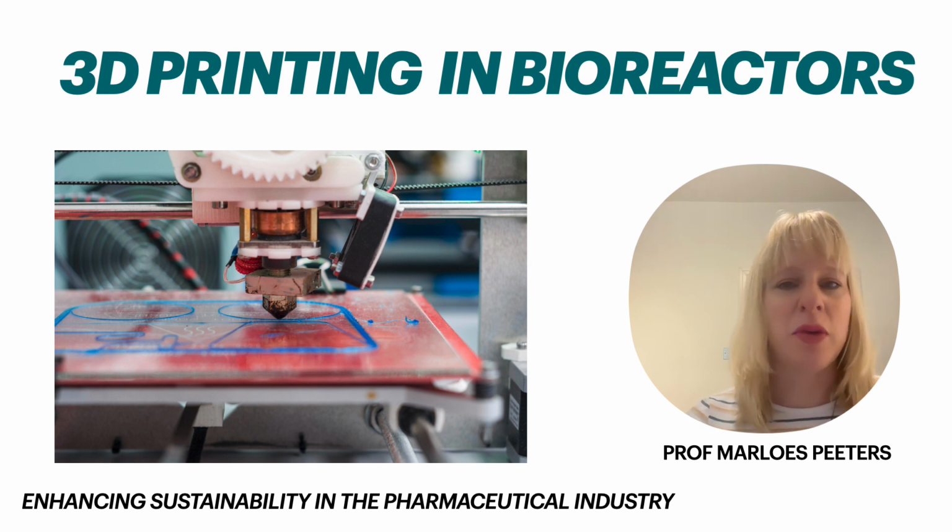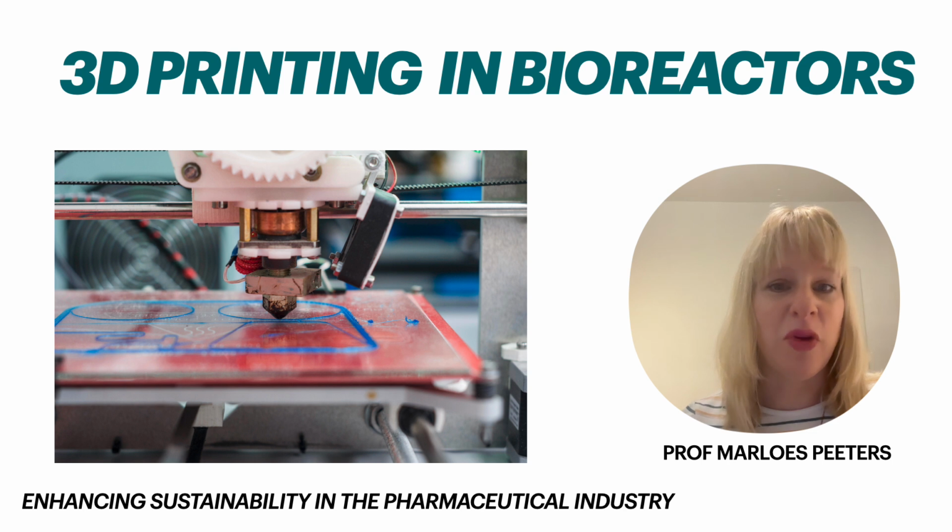Key things I will touch upon are what we can achieve nowadays with 3D printing. So what kind of geometries can we achieve? Leakage will be a problem for certain techniques, and I'll also touch upon the sustainability.